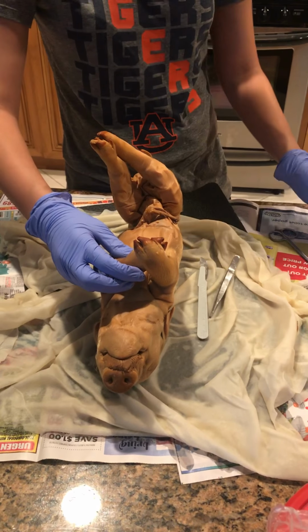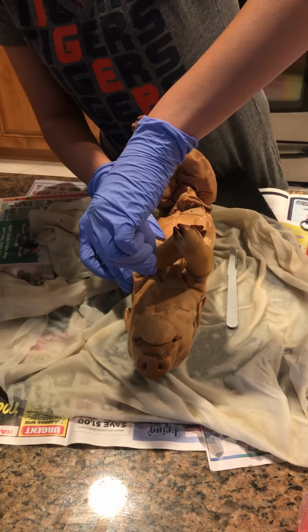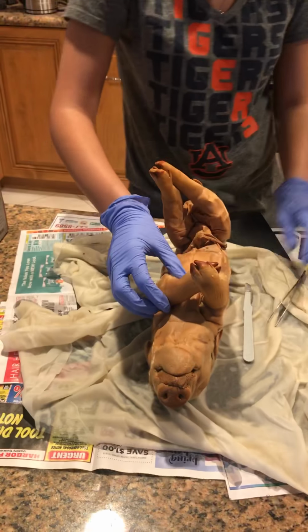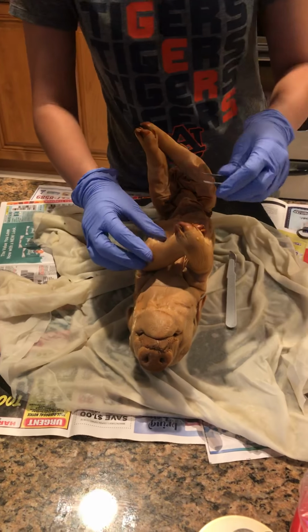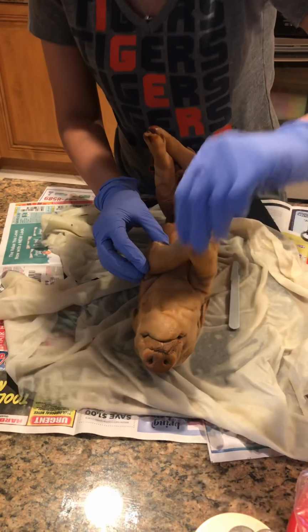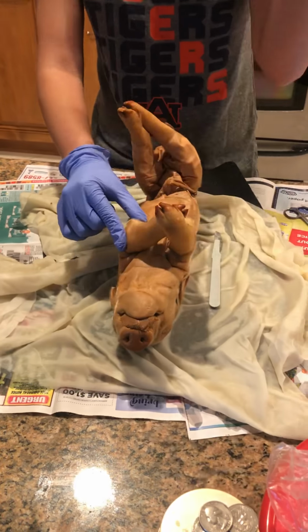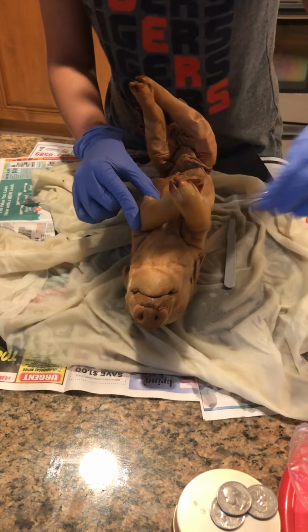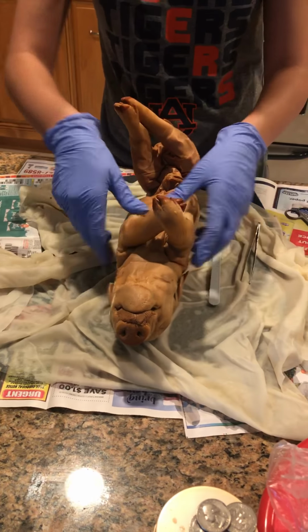Then we have the axillary. The axillary is going to be the little vein that goes right in through here. This one right here. Then we have the vertebral. So a lot of these veins are clustered together. The vertebral is going to be the far left, on my left, his right. Right here. And that is all for the fetal pig.